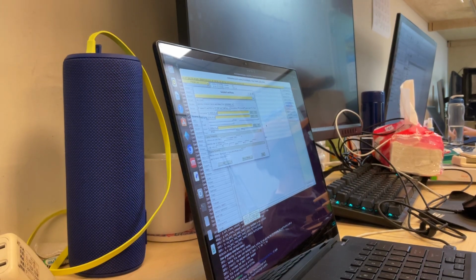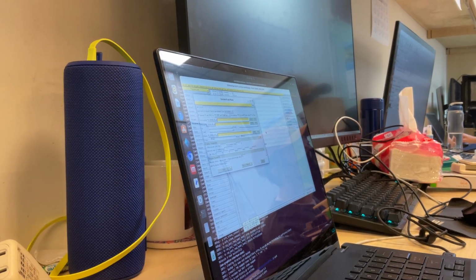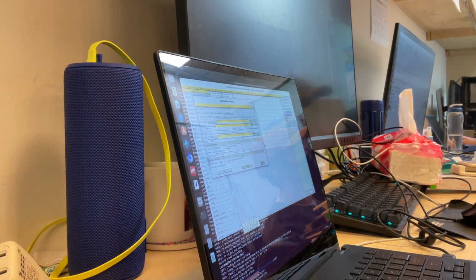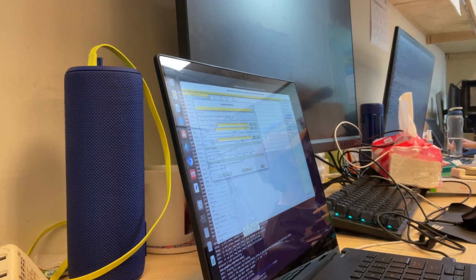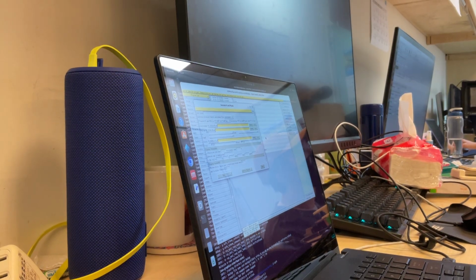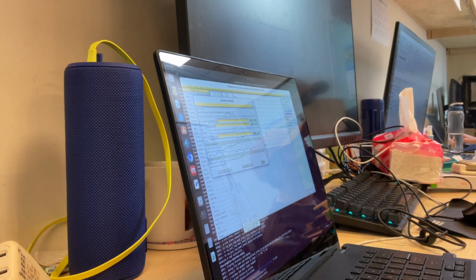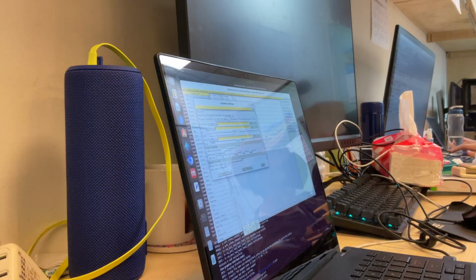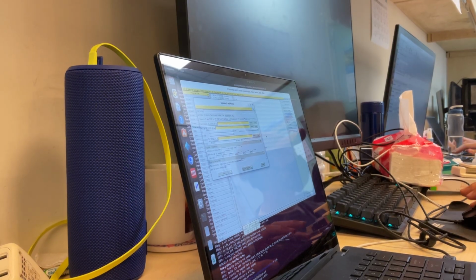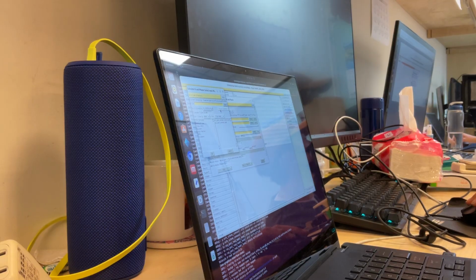Remember, this is what I mentioned, that because you're calculating them, and you know how many electrons are around every single thing, you can calculate the absolute scale of the calculated structure factors perfectly. So that means that now you can use that to scale your observed structure factors so that they are on the perfect absolute scale. You see? So what do we use for this? Well, we use our initial data.